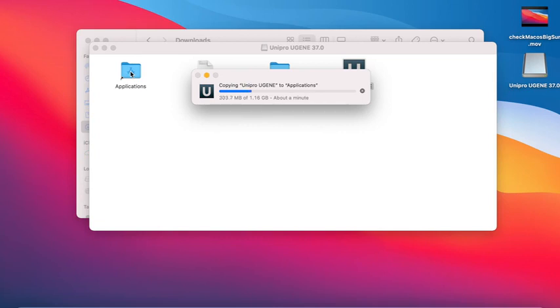And again, this is going to take a little bit of time, so just be patient and follow the progress bar. And again, I could edit this out, but I want to give you a sense of how much time is normal. So let's be patient, and off we go. We're making progress.